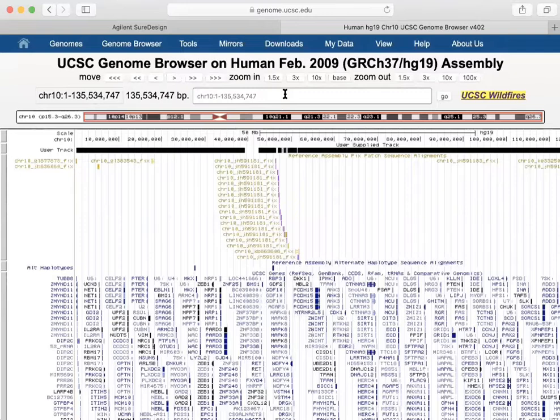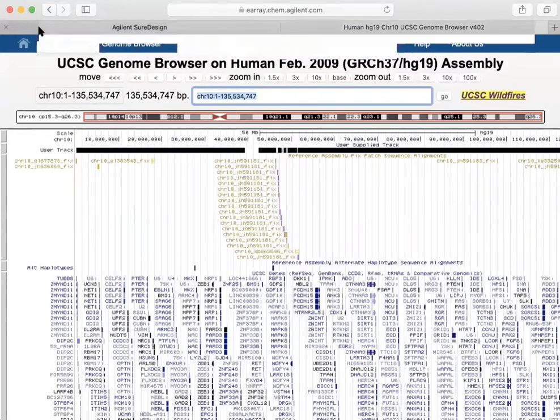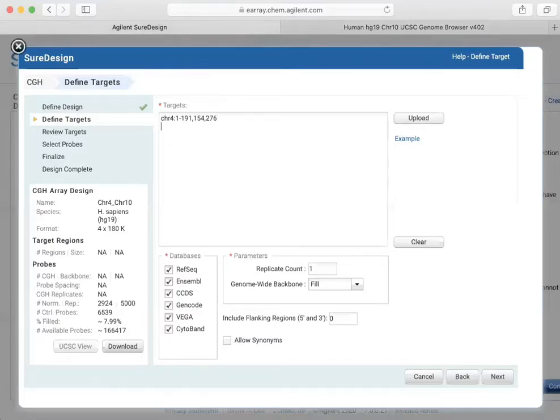Then if someone ever needs a chromosome 4 array, you would already have it available. You want to watch that you don't design something so specific that you'll never be able to use it again. Sometimes you do need to do that, but I try to design probes that are a little bit more liberal, so you can use them again for different projects.